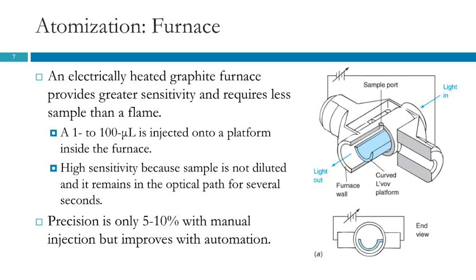The precision isn't as good here. It's only 5 to 10% with a manual injection, but if you use an automatic injector, you can get better precision, because here, how much you put in there is going to affect your signal. Any questions?